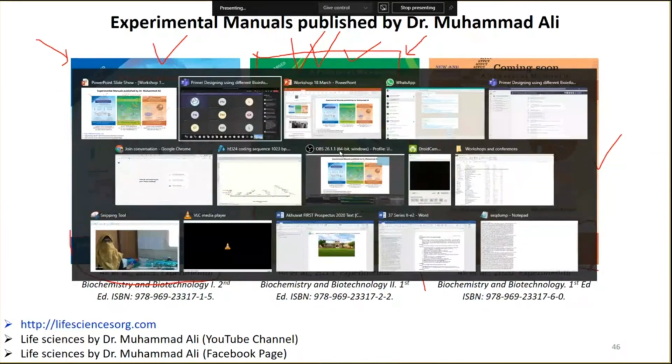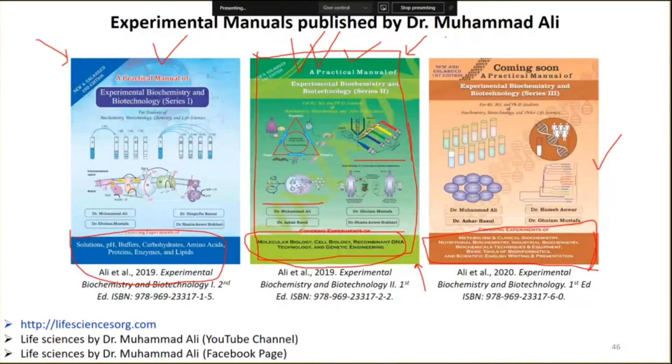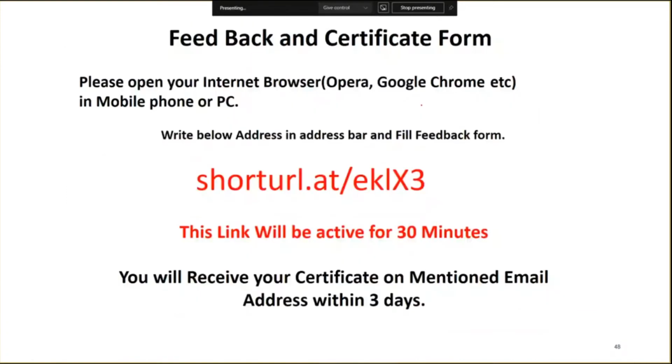Can we carry out some part of the protocol in dry lab, in silico? This is from T. Satyanarayan.